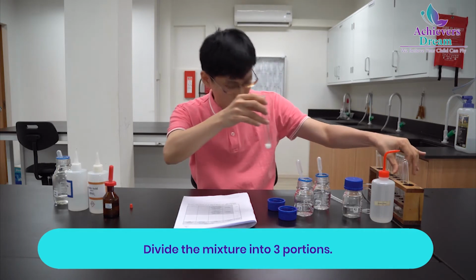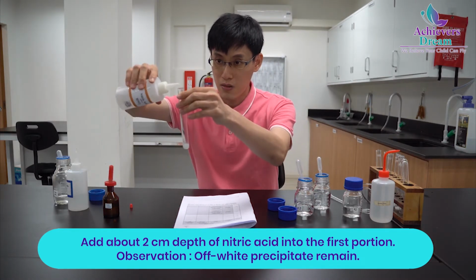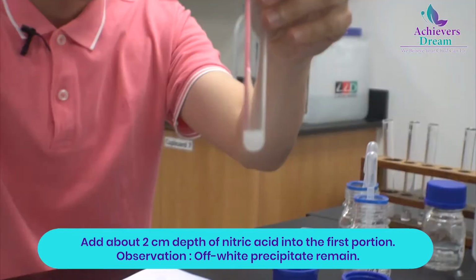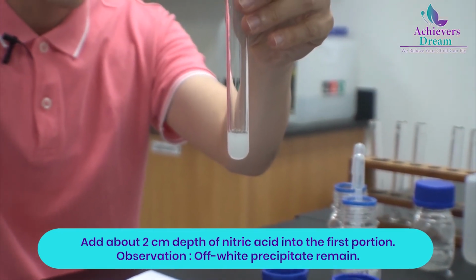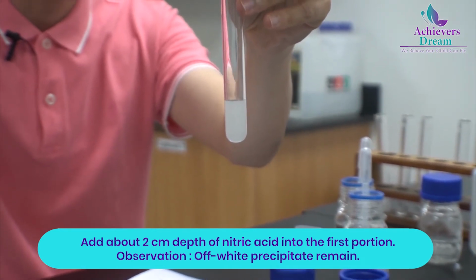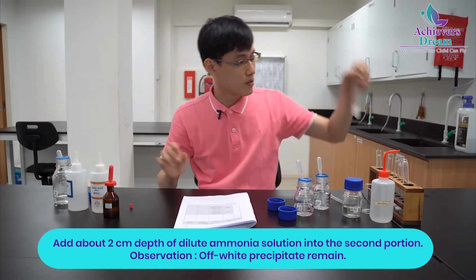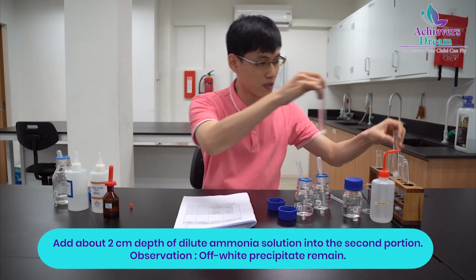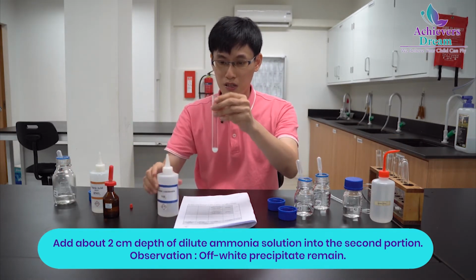Okay, so let's add nitric acid again and see what happens. Precipitate is still there. Let's add some more. Still there, nothing's happening. Precipitate is insoluble. Okay. How about dilute ammonia now?